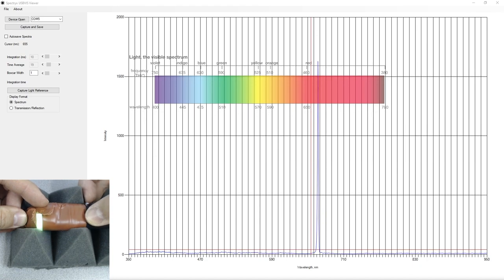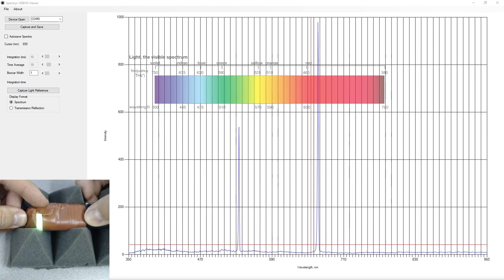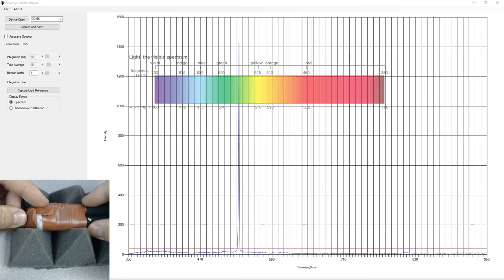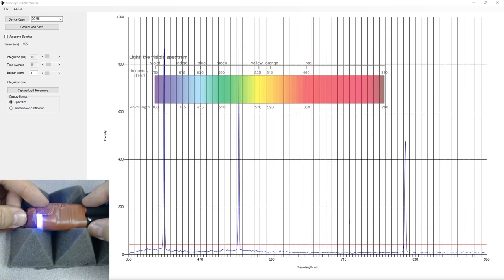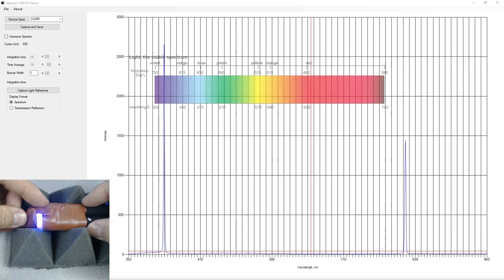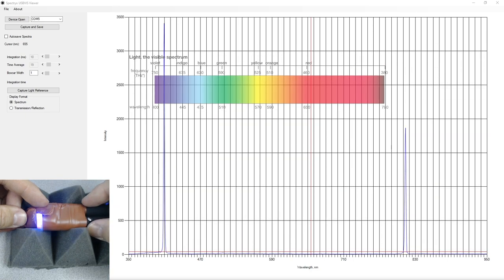So back to the blue. What are we seeing on the blue? Sorry, this is the green again, rather. And we're around about 2,000 there. I might have overdone it with not masking off the blue because it's a little bit high anyway.